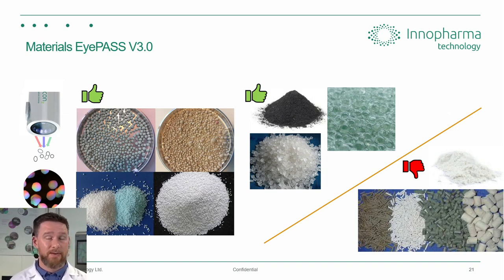So think of something like flour. It's not going to get any degree of separation when it's flowing. You can't measure it. And also materials that are outside the measuring capability of instruments, such as materials of a pellet shape, where they can present either end-on, like a circle to the camera, or side-on, like a rectangle to the camera. Using the elliptical method in the background, it's not suitable for these types of materials.